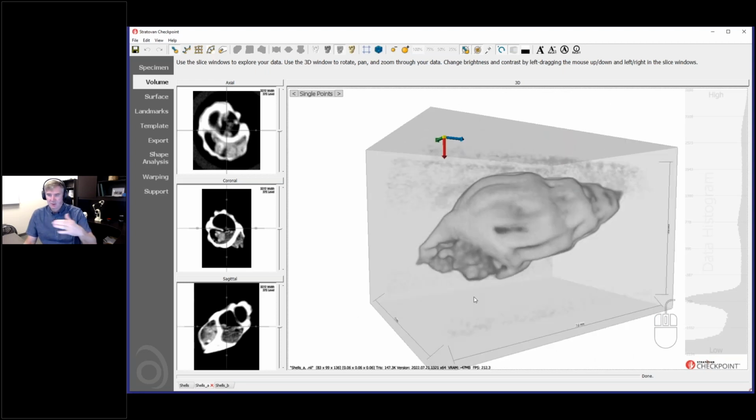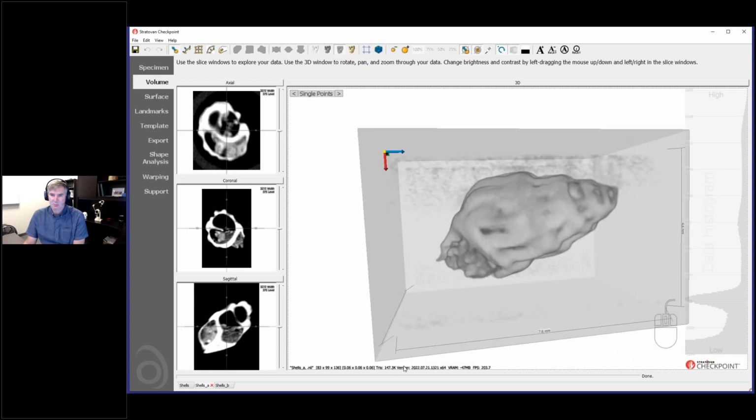You should be able to do this, a little bit tedious, but you should be able to go through each of your specimen and pull them out individually into little subregions. And then this is still at the resolution of the micro CT. So with specimen like this, I wouldn't recommend downsampling the original micro CT because the specimen are so small relative to that original scan that if you downsample the full scan, by the time you pull out your individual specimen, you're going to lose surface detail and that kind of thing.